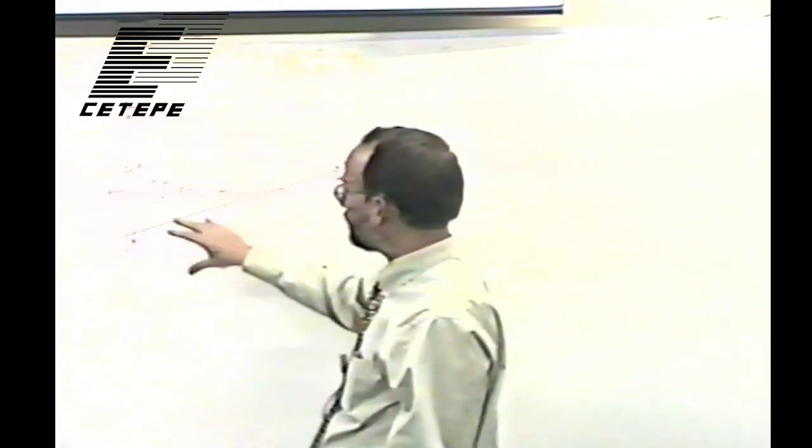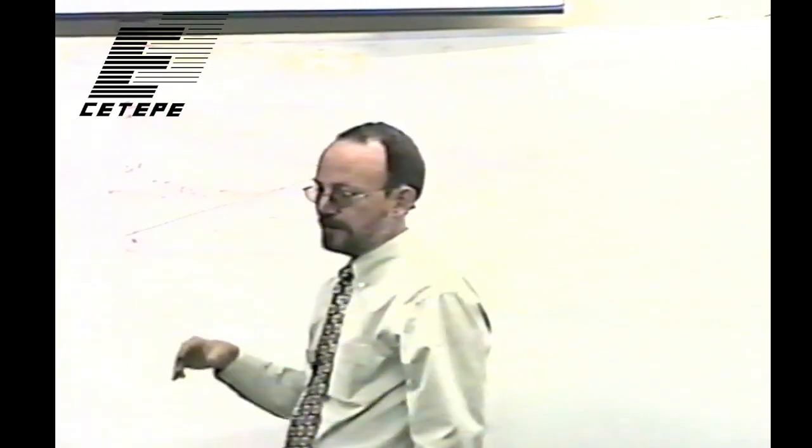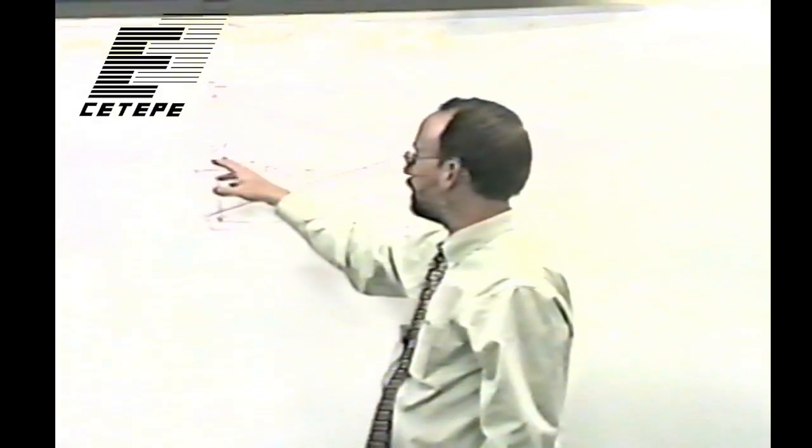I believe it's P25 or something. I don't remember the exact identity of the phosphor, but it's a very bright emitting granular phosphor. So there's actually two sources of gain. One source of gain is just the fact that you've taken a large image. Many devices are 9 inches, kind of a standard diameter.